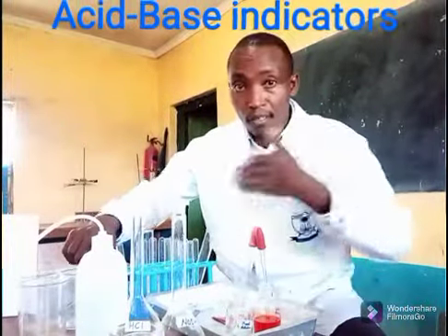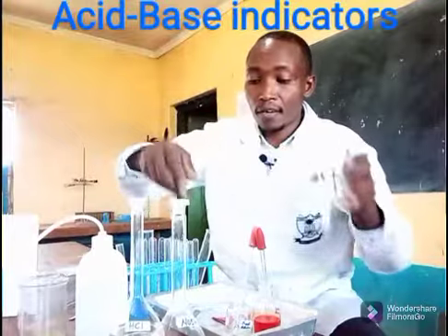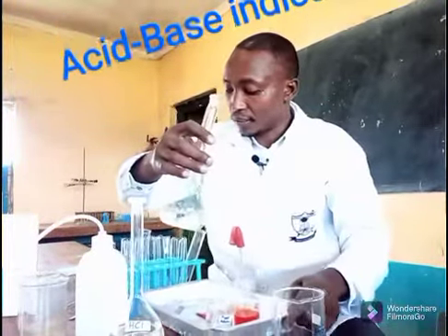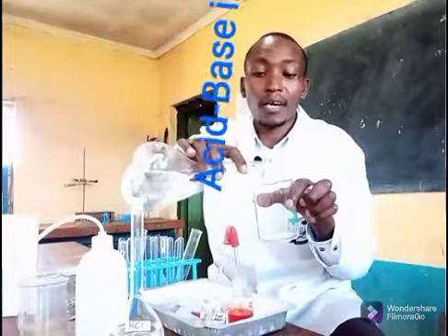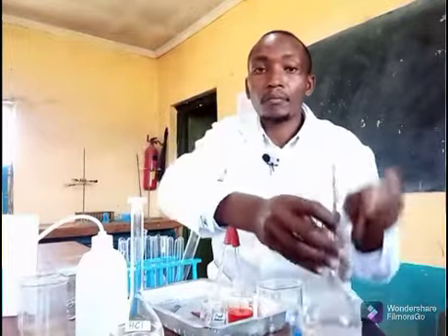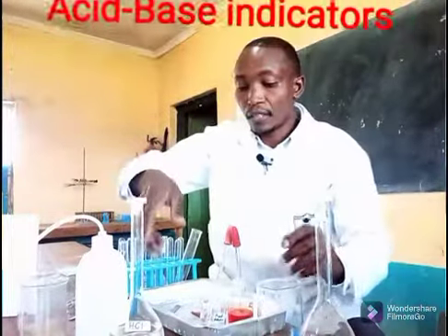I'm going to have the three substances I have here. With the first one, I'll place sodium hydroxide in a beaker. That is sodium hydroxide.